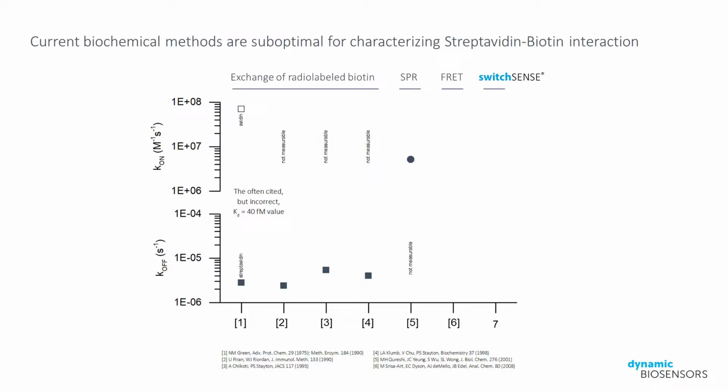While there are methods available for the characterization of tight binders like streptavidin biotin, these methods are either: 1. Established techniques that are suboptimal, like SPR and radiolabeling, which suffer from various drawbacks, including low flow rates and high technical barriers to entry, or 2. Ad hoc techniques that require high expertise and have low throughput, such as chaser assays, droplet-based microfluidic platforms, and specialized FRET systems, among others. So far, either K-on or K-off have been determined with high precision using these methods.